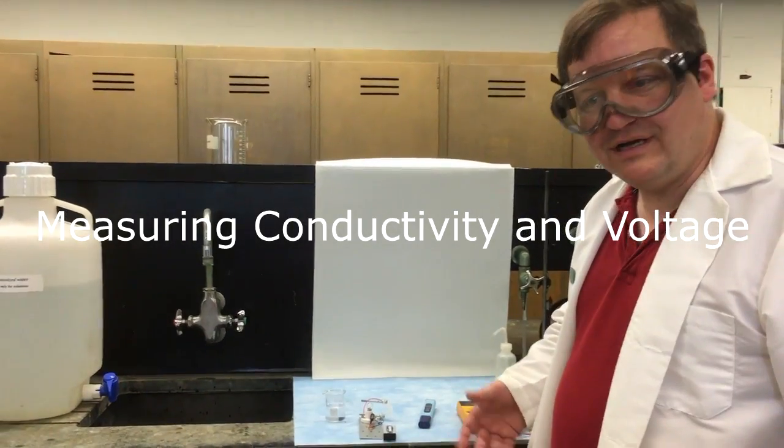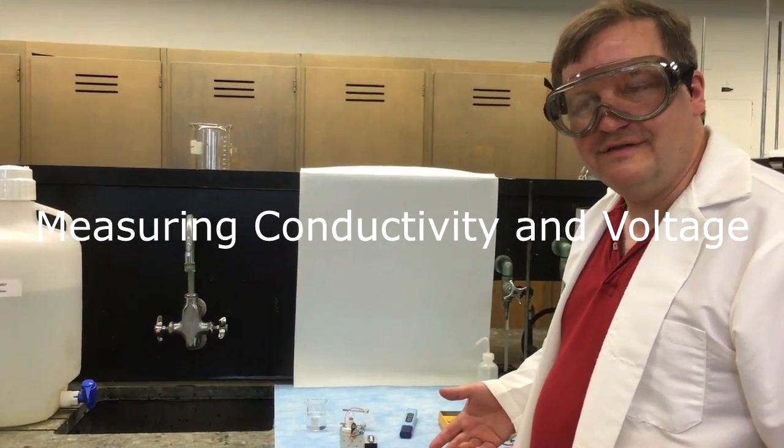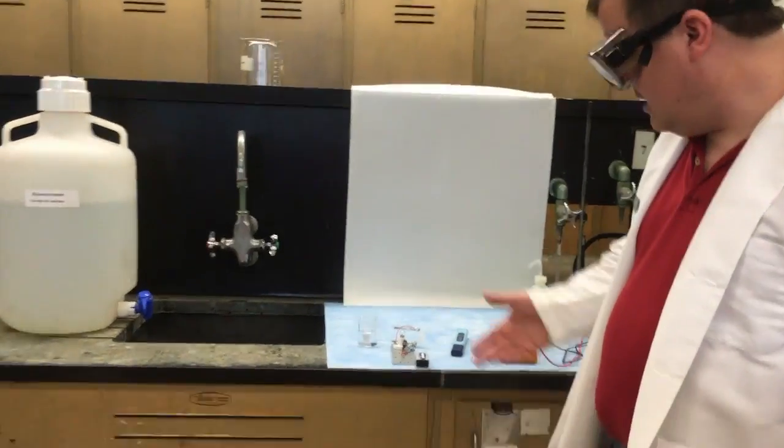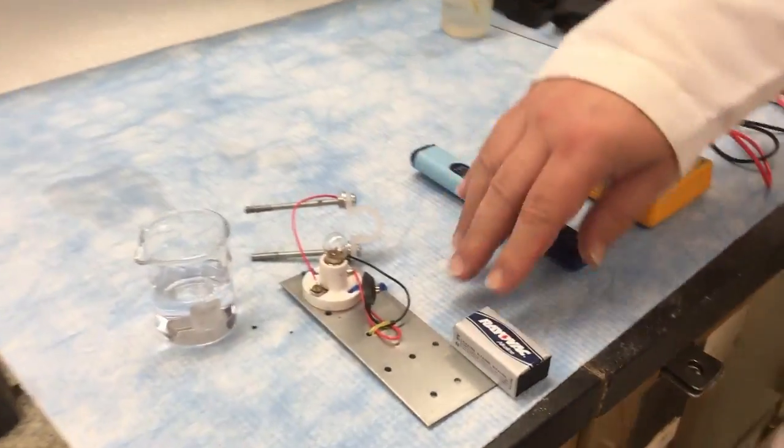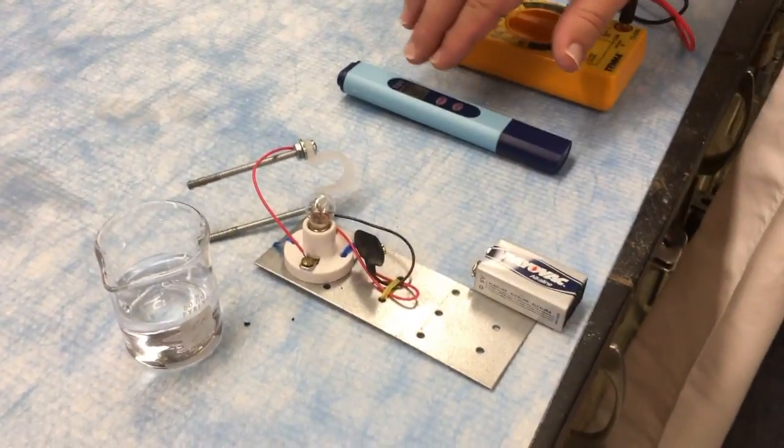Okay, so now we're going to go over some apparatus we use for the conductivity and electrochemistry experiment. If you look here I have two different types of conductivity. This is a home-built one and this is a commercial one.